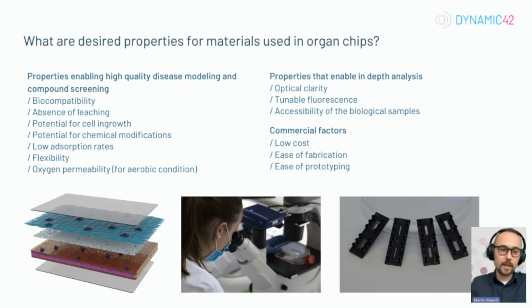So compound screening of classical small molecules, for instance, but also new applications like biologics, tri-specific antibodies and so on. What can also be a nice feature is flexibility of the material.